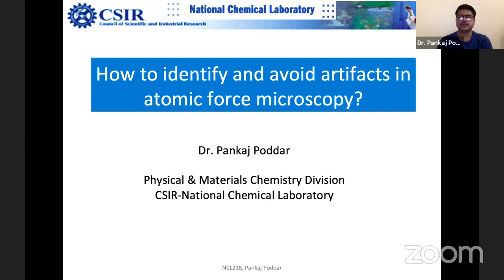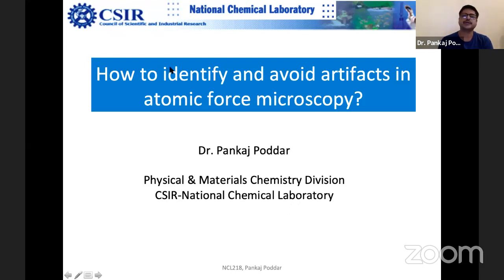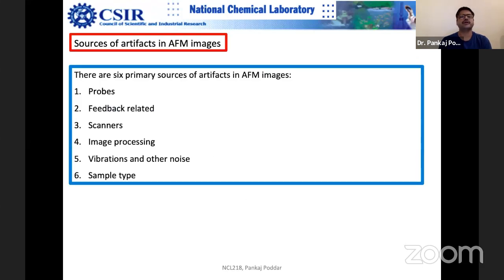In fact, some people say that over 90% of images may be an artifact. So this topic is highly important considering that we tend to make a lot of mistakes. First, we have to understand how to identify the artifacts and what are the primary sources of artifacts in AFM images. Number one is AFM probes.